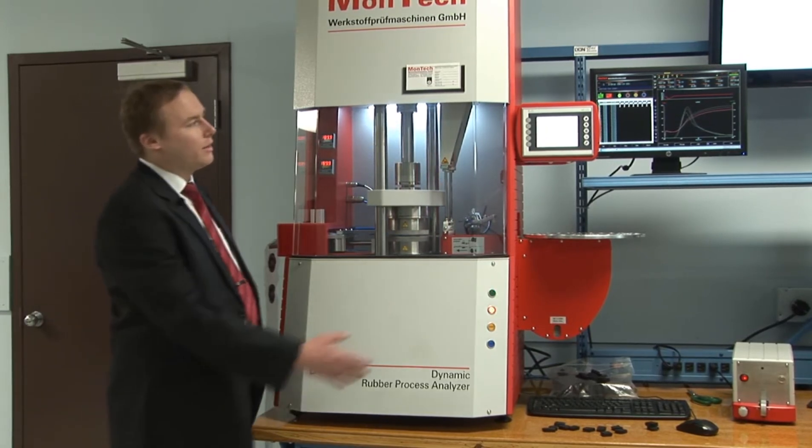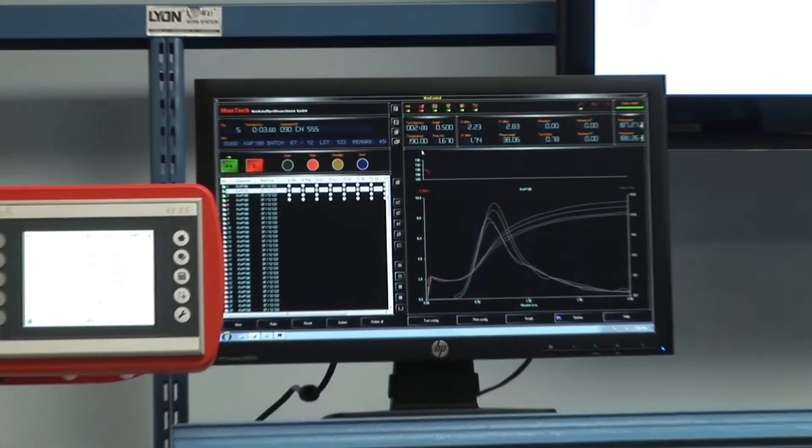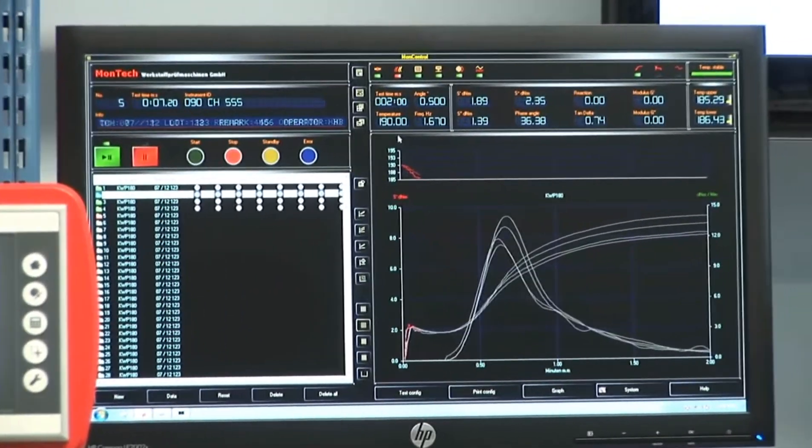Now having a look at the MonControl software. The MonControl software is used to set up all your test configurations, store your test parameters, and record the results.